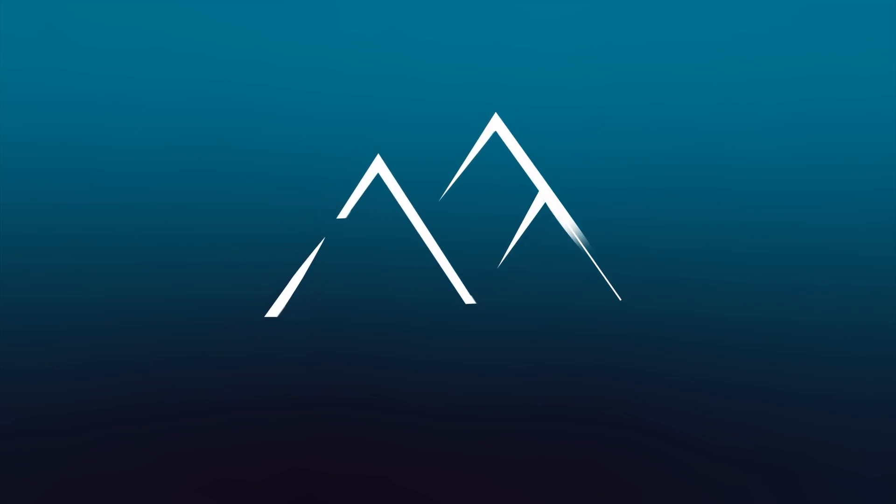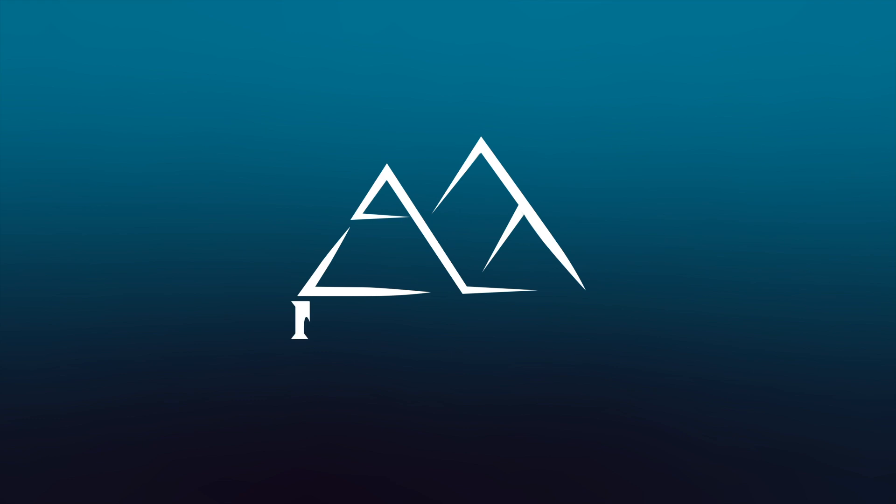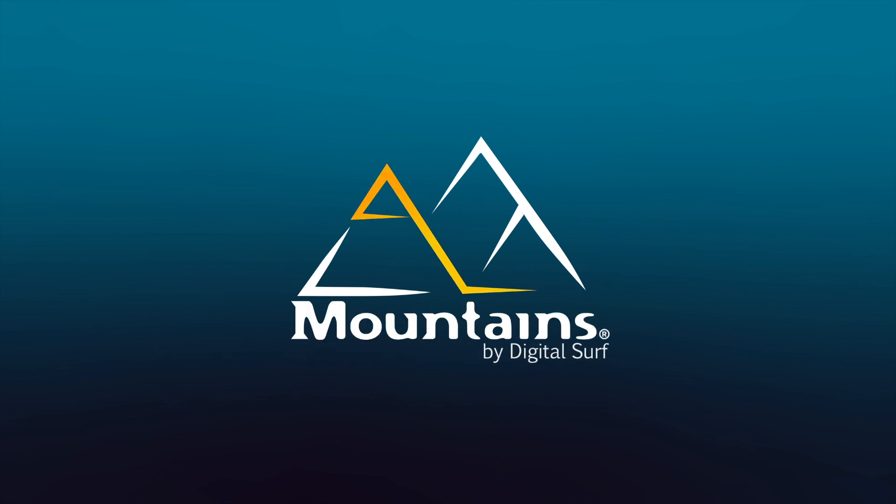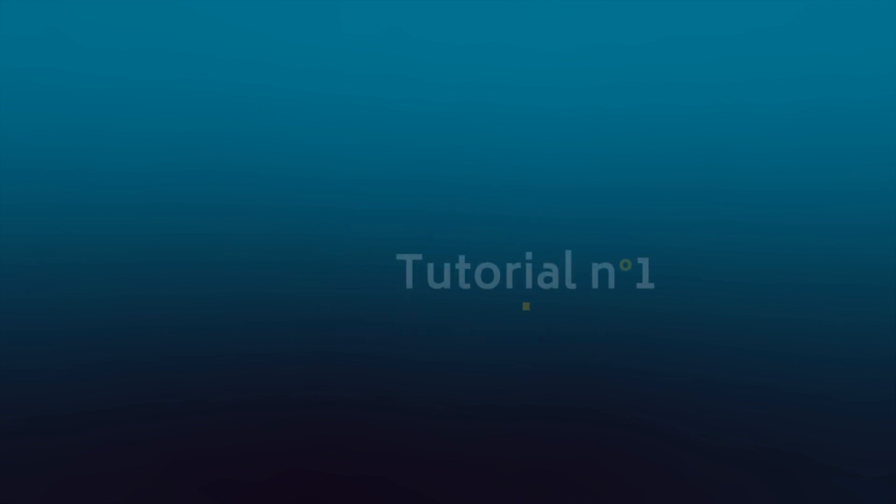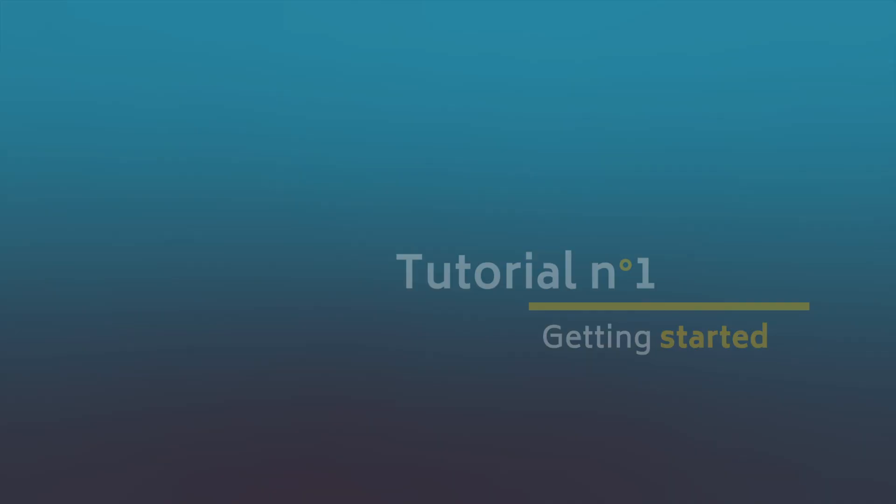Hello and welcome to the first video in this tutorial series on MOUNTAINS, DigitalSurf's industry standard software for profiler and microscope data analysis. Let's begin with a little vocabulary.